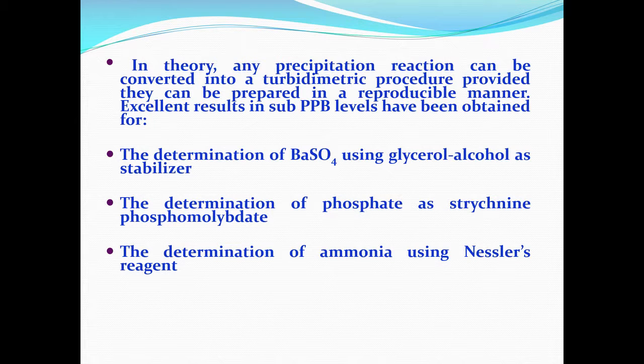If drinking water is very hard, we suspect that calcium and magnesium sulfates are the cause, and in drinking water it should not exceed 200 ppm. Sulfate at 200 ppm means you cannot do the determination by titration and other things, even though EDTA can help in such matters, but this is an excellent example of how a simple analyte, that is sulfate ion, can be determined using spectrophotometry.